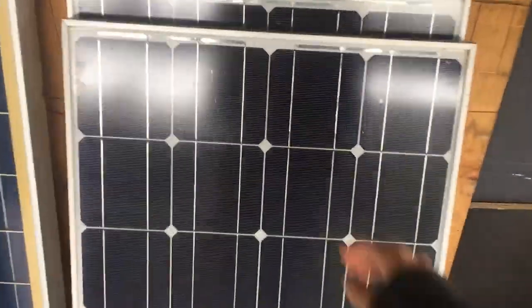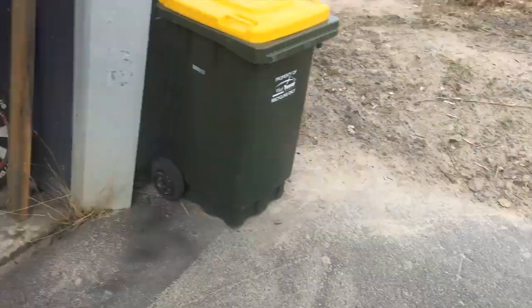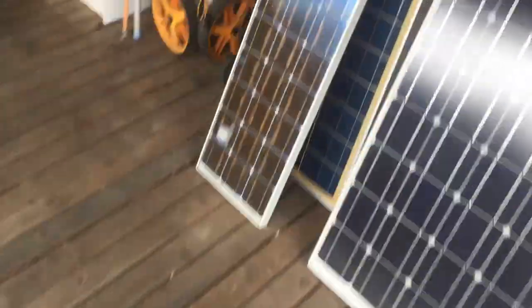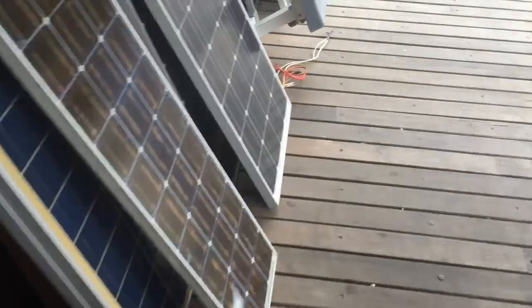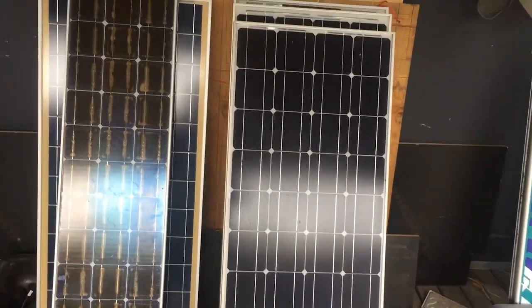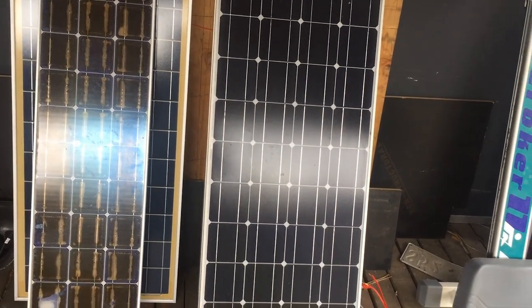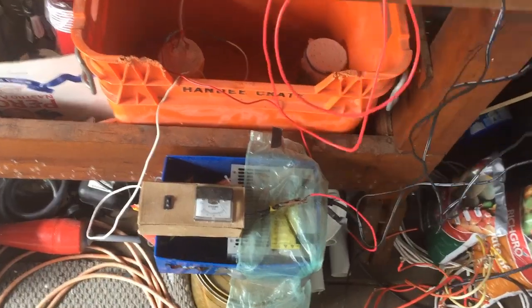I was thinking, if I just grabbed one of these and took it out, put it in the sun, we could directly power the electrolysis using solar power rather than this computer power supply. What I'm actually waiting for is a current-controlled buck converter in the mail. When that arrives, maybe I'll set up one of these solar panels, connect it to the buck converter, and then just directly run the electrolysis every day when the sun's out.